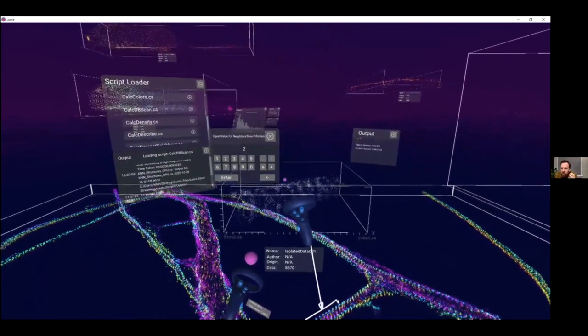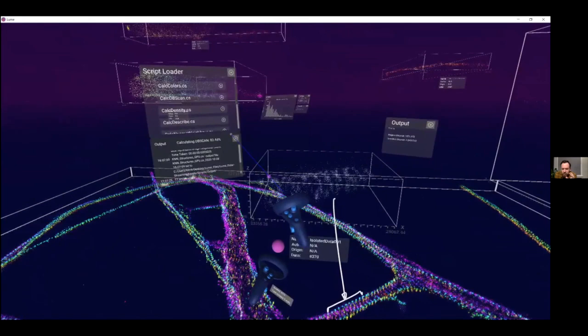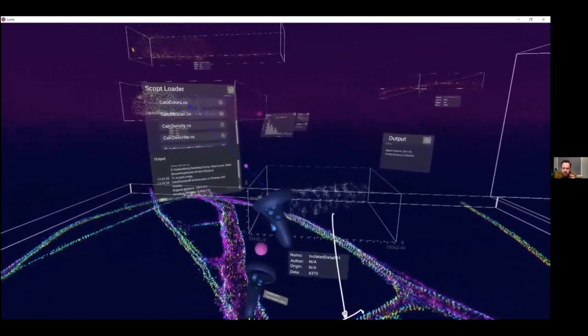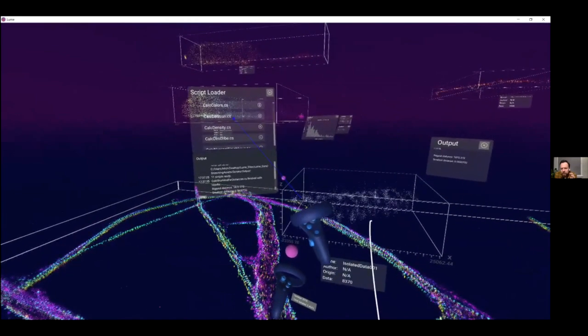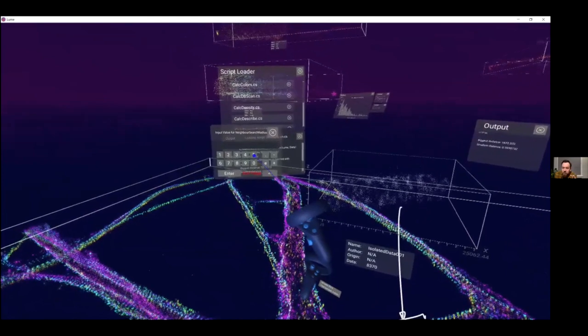And you're absolutely right, you could do. But what we found, and actually what's been so wonderful collaborating with Alex on this project, is that what this allows researchers to do is really explore their data in an extremely intuitive way.